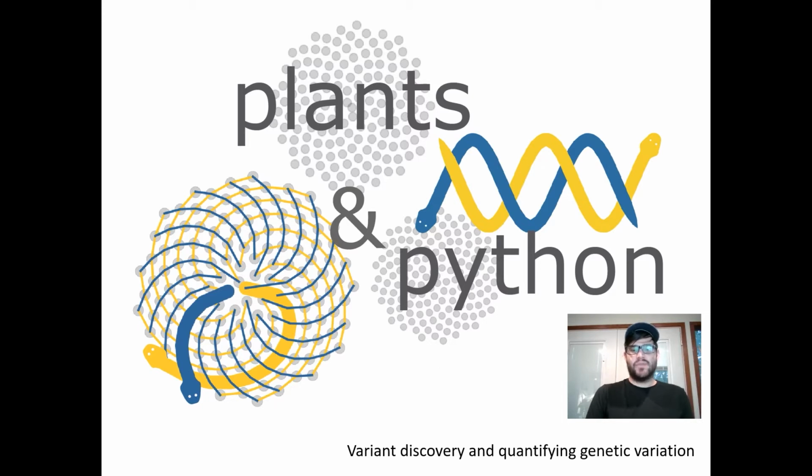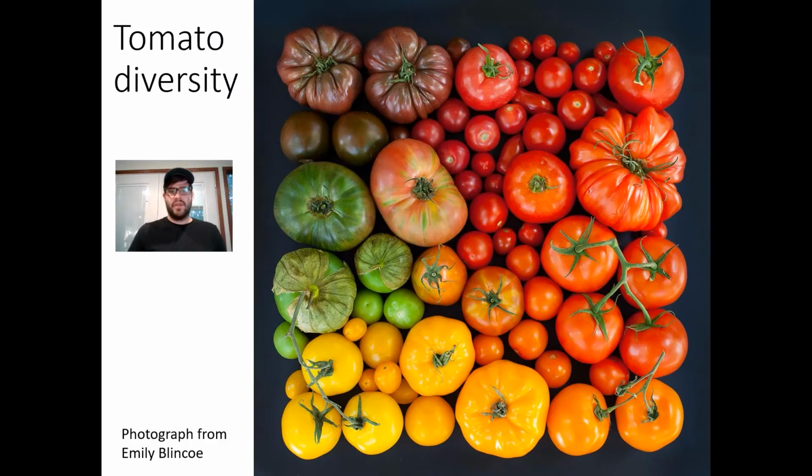And in today's lesson, we will talk about variant discovery and quantifying genetic variation in plants. So far in these lessons, we've talked about how to assemble a genome using raw data, how to annotate and compare genomes between species, and what components make up a genome. And we've also talked about how to quantify some element of activity within a plant, with an emphasis on gene expression or RNA-seq. The next step in this lesson is how to quantify genetic variation between individuals within a species.